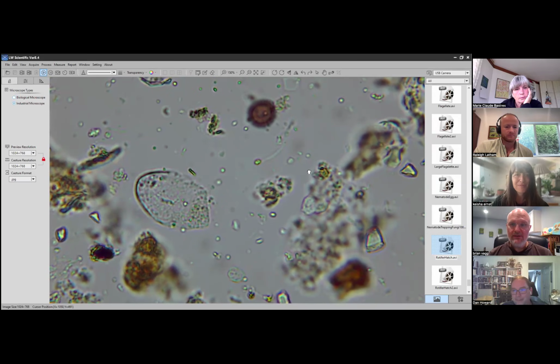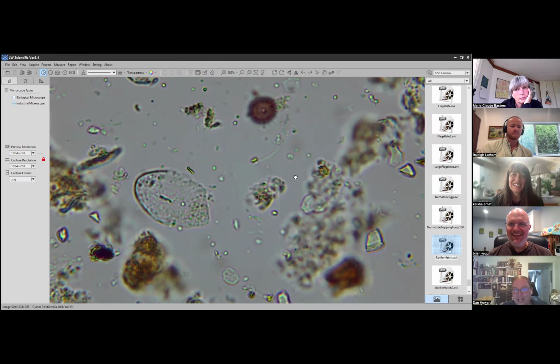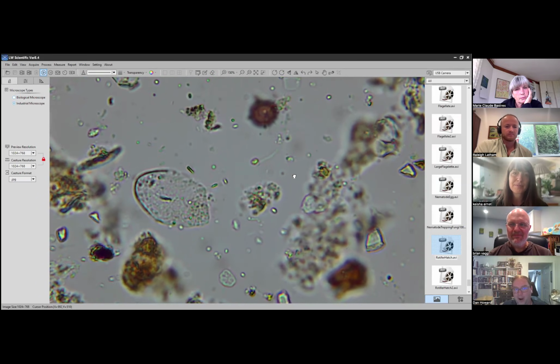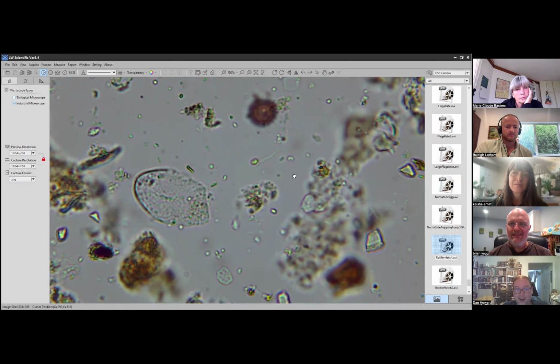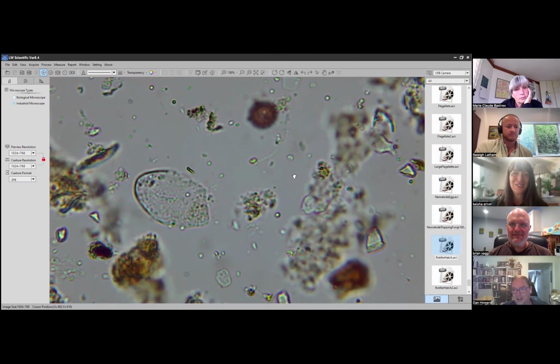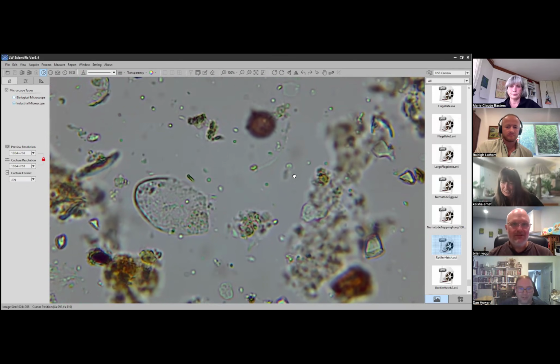Have you been looking at your garden soils to track those over time, just to see how they look? Yeah, we applied the extract several times in the summer and I monitored it, and the soils looked great. They looked really good after applying the extracts. That's so cool. I don't have a fantastic sample of that now, but yeah.